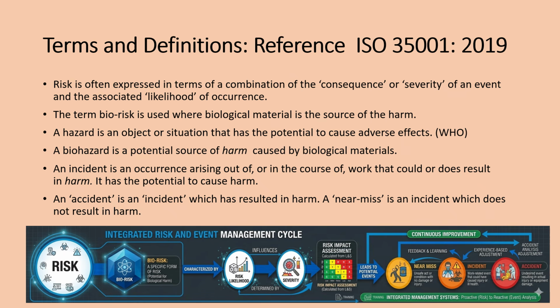The term biorisk is used where biological material is the source of the harm. A hazard is an object or situation that has the potential to cause adverse effects. A biohazard is a potential source of harm caused by biological materials.